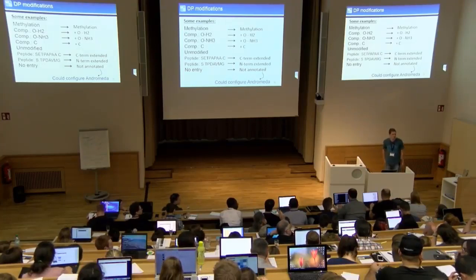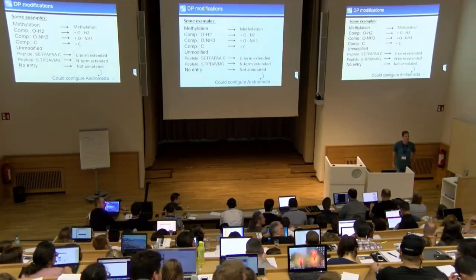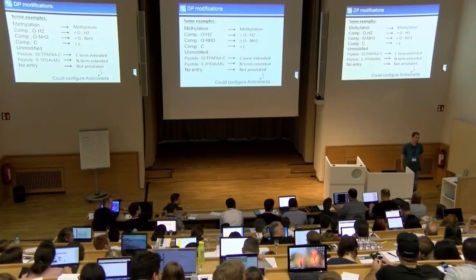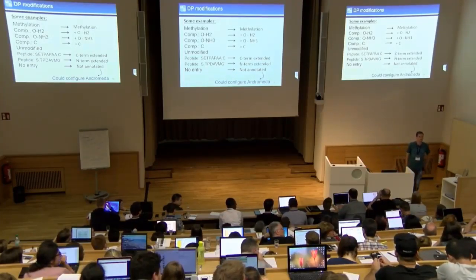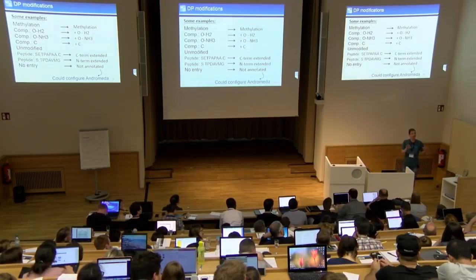My question is about mass shift determination. How do you specify the delta M? Does it scan for all the possible delta M's between the unidentified features and the already identified peptides? Because it seems like a huge computational work. And if it doesn't, how does it figure out which delta M is more likely to appear? I think this is easiest to answer if you think about the MS1 features.